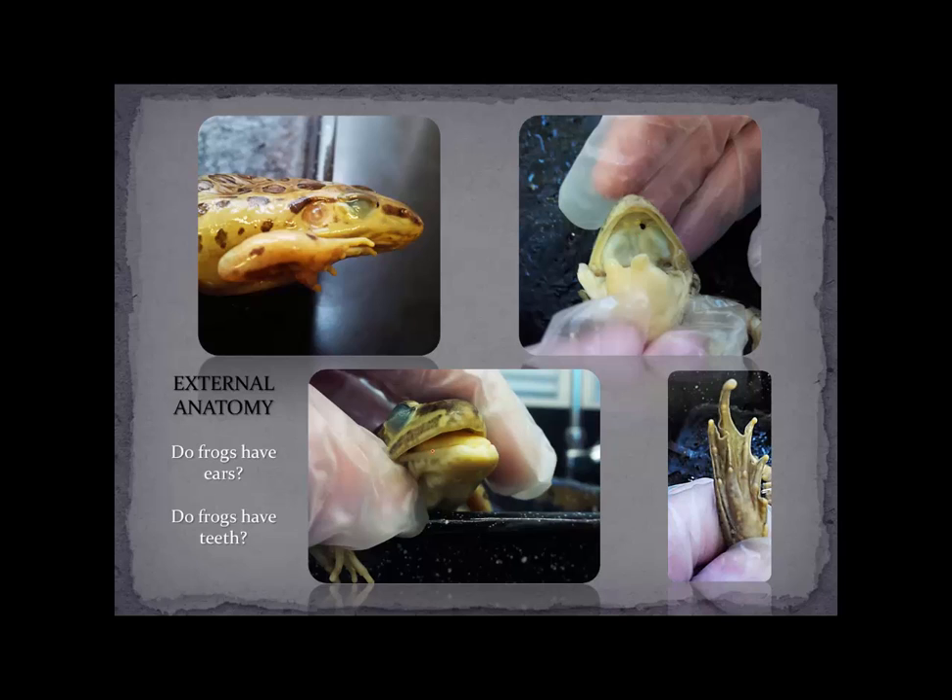So in order to do this, you're going to have to open the mouth of the frog — open the mouth, have a look at the tongue, have a look at the external and internal nares. Also, do frogs have teeth? You're going to want to feel the jaw and the lower jaw to see. You can also look at the feet and look at whether the fore or hind legs are webbed or not.